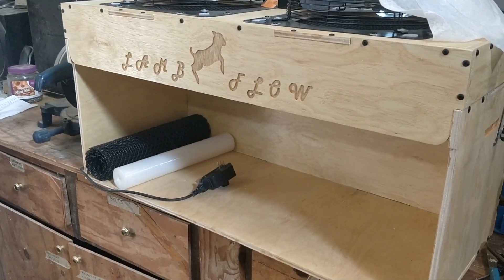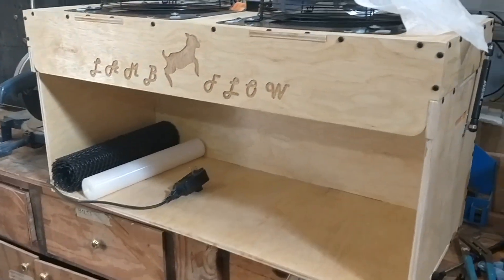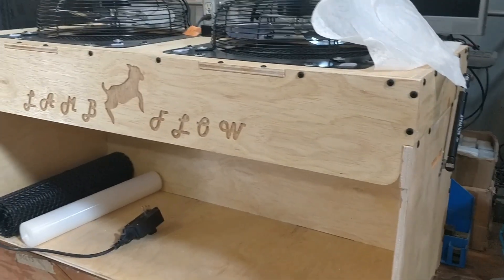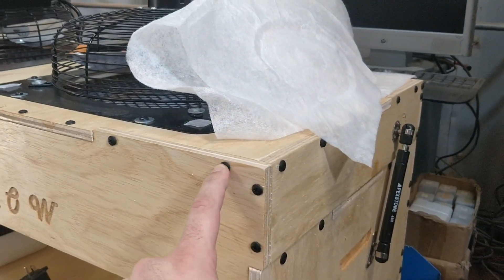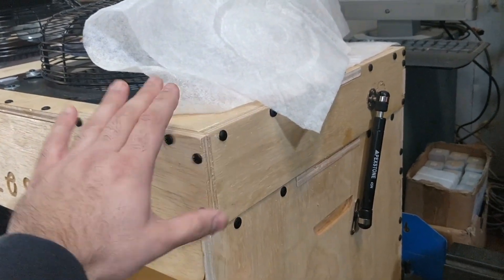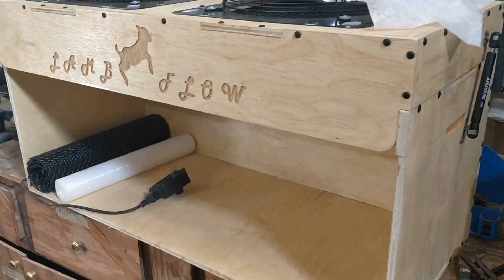I'll go over the basic construction of this next. Whether you bought one or you're looking to design one, feel free to take some design ideas off this. You've got some self-drilling or self-tapping screws, so it's very easy. The holes are pre-drilled, so you know exactly where to screw these in — just hold it to where it needs to be and zip it in.